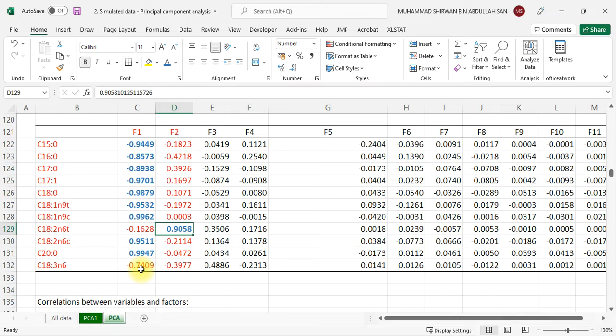by the PCA. In the DA, we talk about 13 variables. Out of 13, 11 are able to discriminate or differentiate between sources. But when we bring these 11 to PCA, out of 11, the most significant ones are only 10.